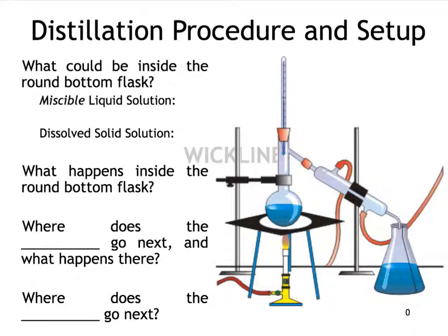So one of the more creative tasks that the Regents may ask you to do is how to separate mixtures, whether homogeneous or heterogeneous. Now, heterogeneous mixtures are a little bit easier to separate, and we will cover most of the processes for separating heterogeneous mixtures tomorrow. But today, there's a process that you can use to separate homogeneous mixtures, those ones that are really evenly mixed, which requires a bit of a setup, and it requires basically all of this equipment.